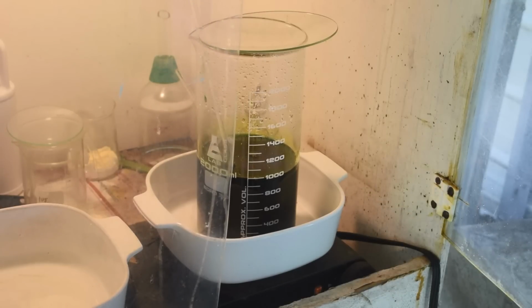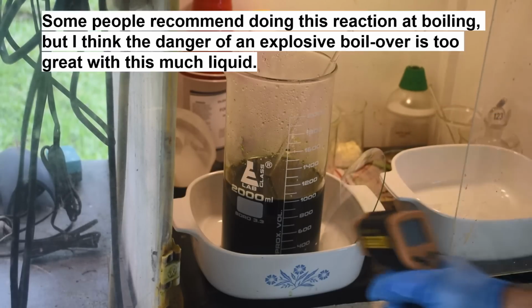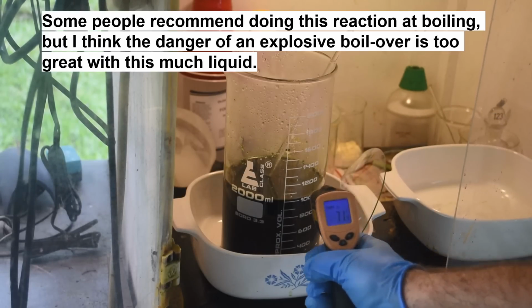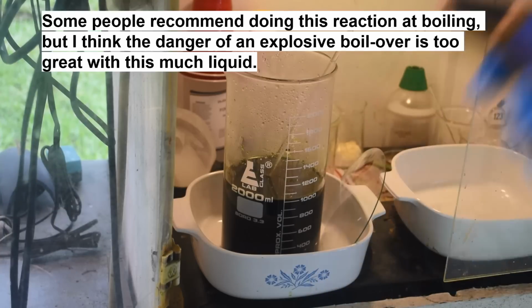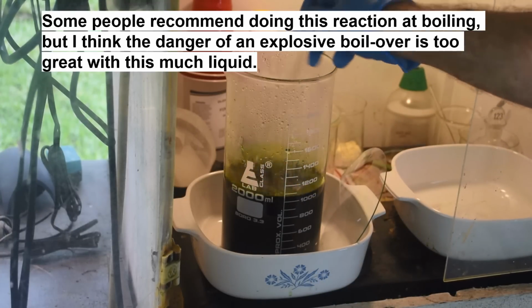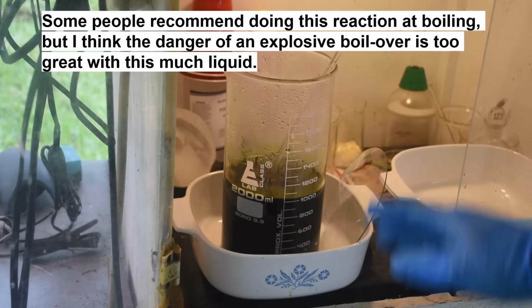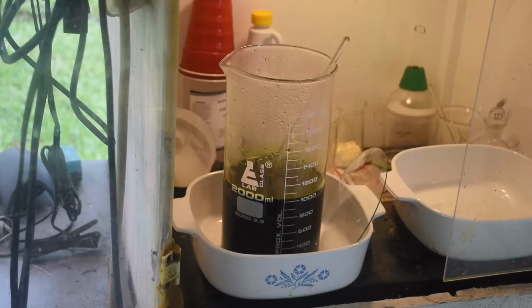Alright, I've moved this stuff off the heat because it actually got a little warmer than I wanted. Where are we here? 71C. That's like at the high end of where I want to do this reaction. Now I put in about another half a scoop of ammonium chloride and it took a while to dissolve. So I think we're good to go here for the next step. And what is the next step, you might be asking?